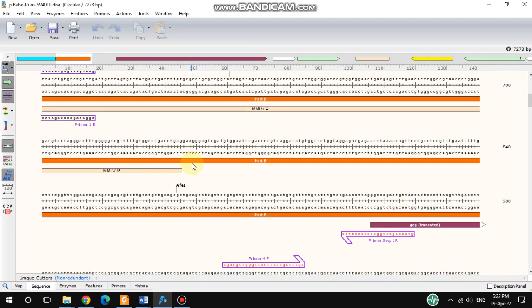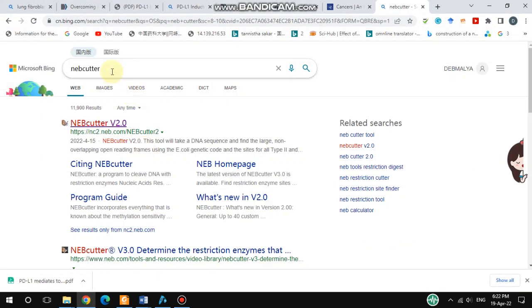By this way you can find restriction sites yourself in SnapGene. But apart from this, there is another very useful tool — the NEB tool — where you can find restriction enzyme sites and detailed information about them. Let's move on to that part: how to use NEBcutter.